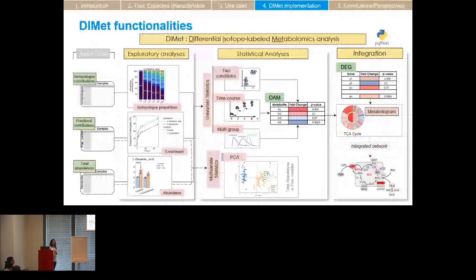Yes, precisely. In DIMet itself, we had the intention to offer this module, but as many platforms change formats, we had to isolate this module in another, different tool that also has a GitHub, the trace groomer. For example, if your platform gives you the tables in an Excel file, because Excel files are not accepted in DIMet, you can transform them via this tool.